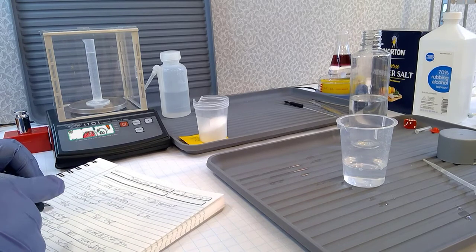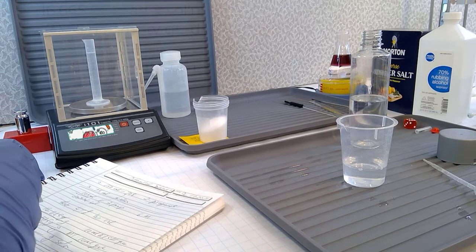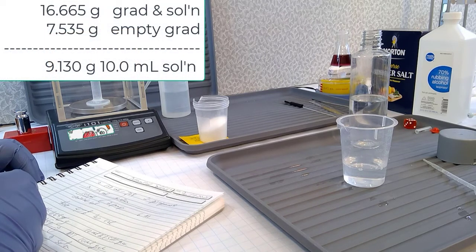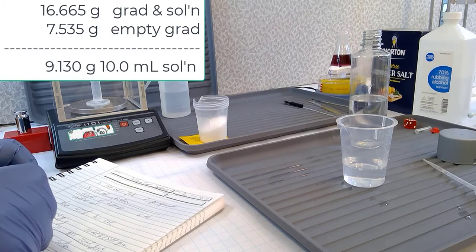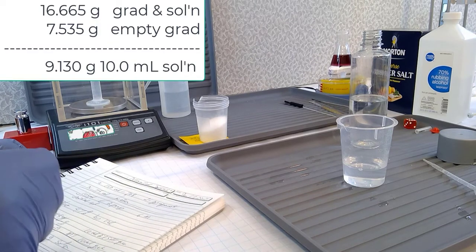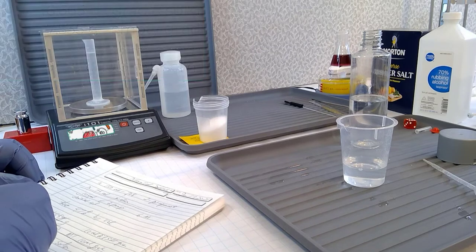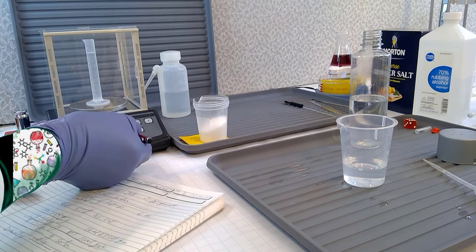Alexa, what's 16.665 minus 7.535? 16.665 minus 7.535 is 9.13. Okay, 9.13. That's what I've got. Grams is how much solution I have. This is 10 ml, so my density is 0.913 grams per ml. This last sig dig is sort of an iffy one.